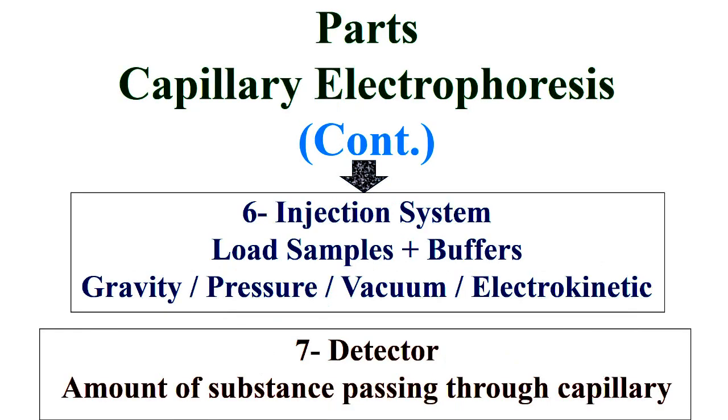And the injection system, used to load samples and buffers by gravity, pressure, vacuum, or electrokinetic means, and the detector, used to monitor the amount of substance passing through the capillary.